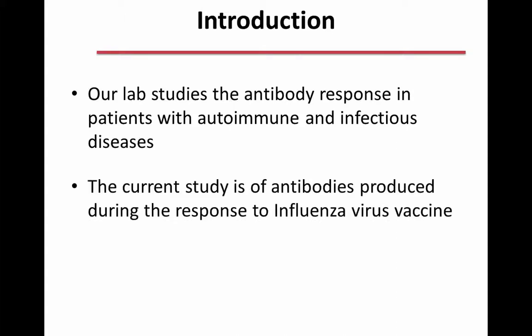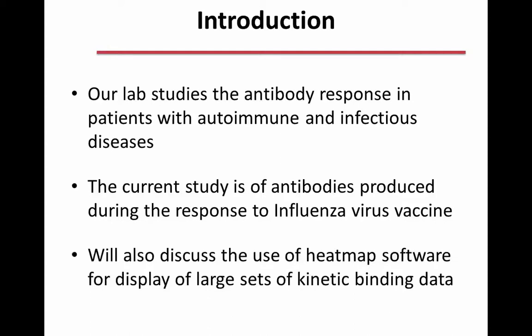In the study I'll talk about today, we have investigated the binding kinetics of a panel of monoclonal antibodies that were produced from human plasmablast cells following influenza virus vaccination. And I'll also take a few minutes to discuss the use of heat map software for the display of large sets of kinetic binding data.